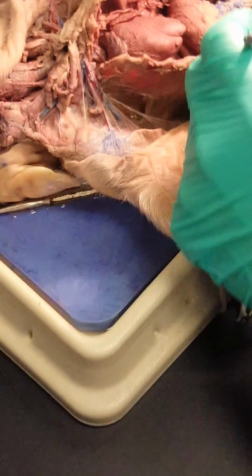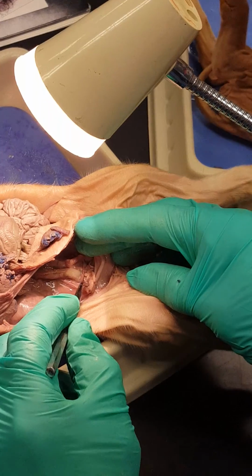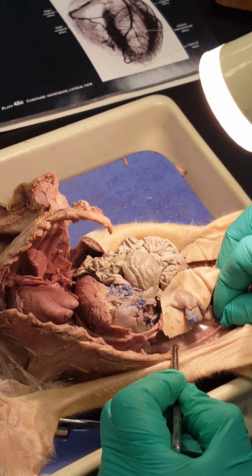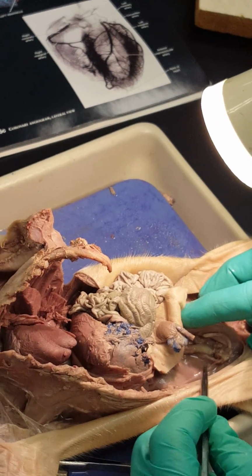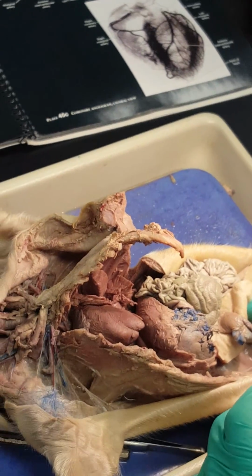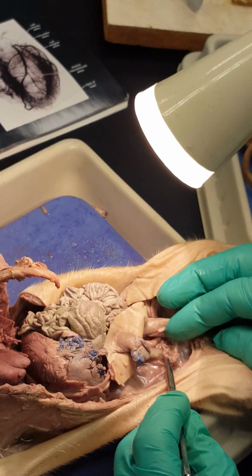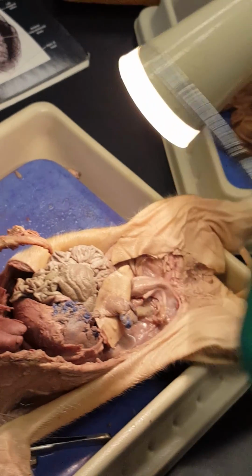So the last thing to show on here is if we move the viscera aside, we see this is a female. And there's a little ovary here. And there was an oviduct here leading to the ovary from a funnel-like opening here in the wall of the peritoneal cavity. Because the eggs are actually released into the peritoneal fluid, find their way into the funnel, and go down into, ultimately, the uterus. And this squiggly stuff are arms of the uterus. Now, our uterus doesn't have as many arms. It has more body than arms.